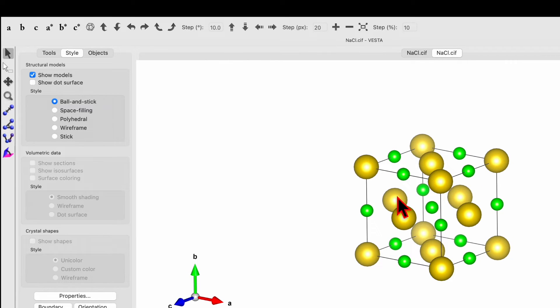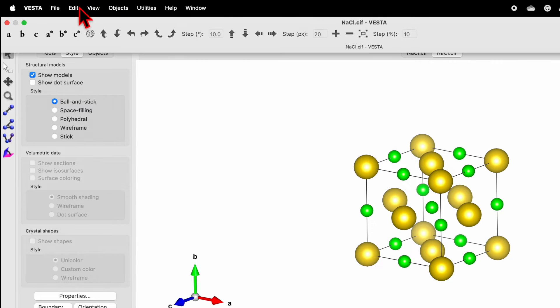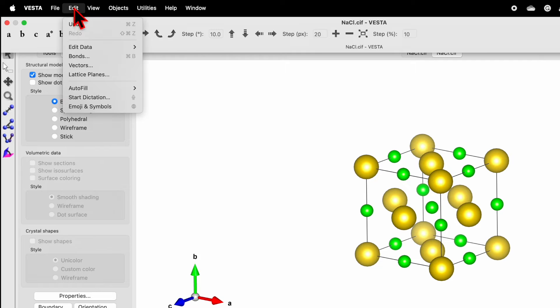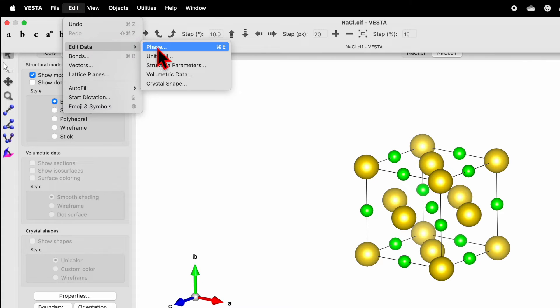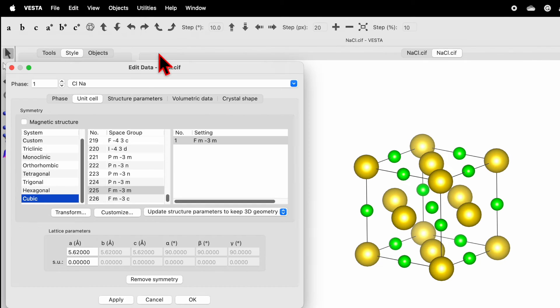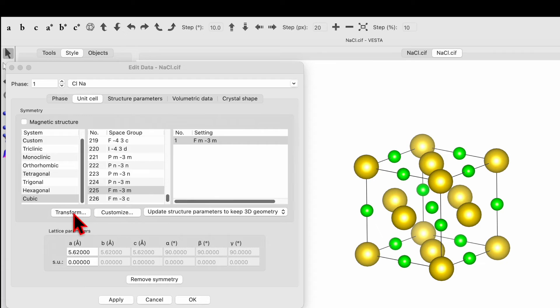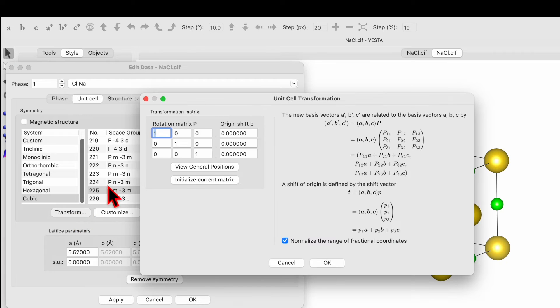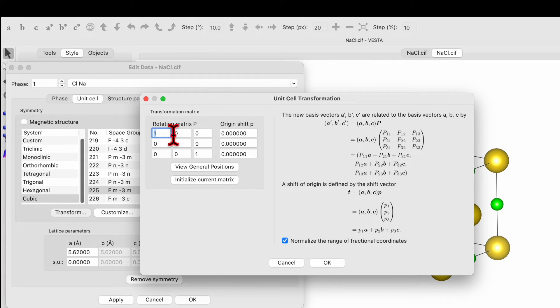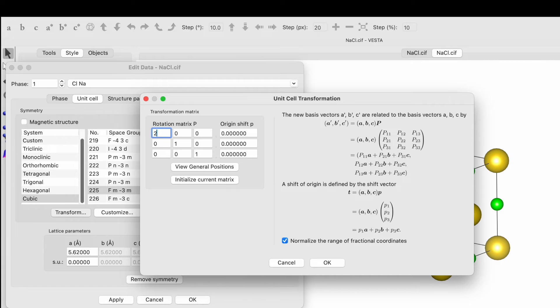Now go and click on edit, edit data, and go to the unit cell. Now click on transform and over here you will find transformation matrix. If you change number over here one to ten or whatever number you want, then it will help you to transfer this unit cell along the x-axis.